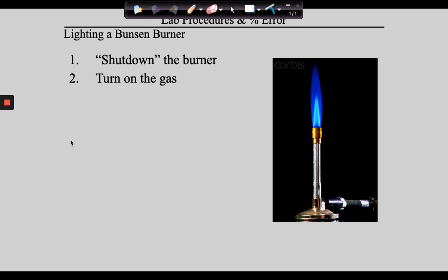And guys, if you look up here with me, my gas tap is here. Yours are on your benches. The difference is yours are horizontal, mine are vertical. In either case, if you listen carefully, when the handle lines up with the nozzle, then the gas is flowing. So anytime the handle and nozzle are perpendicular, it's off. And when they are aligned, parallel, it is flowing. Now guys, understand, when you mess around with your Bunsen burners, you're welcome to pick them up, but don't disconnect them. I just did that to show you how they work.